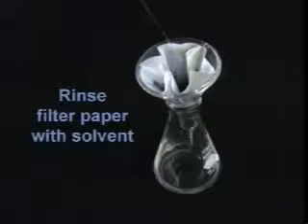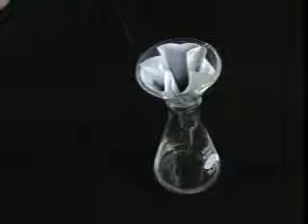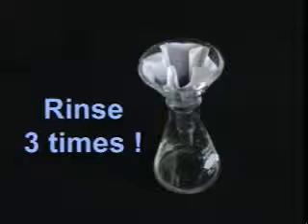But don't forget, you want to rinse the filter paper with solvent as well. Use a pipette. Like always, you want to rinse your flask and the filter paper 3 times each. When you think gravity's done all that it can, it's time for collecting the product.